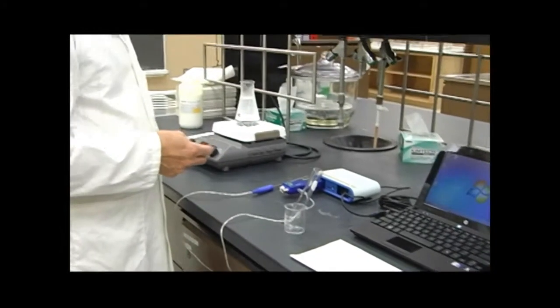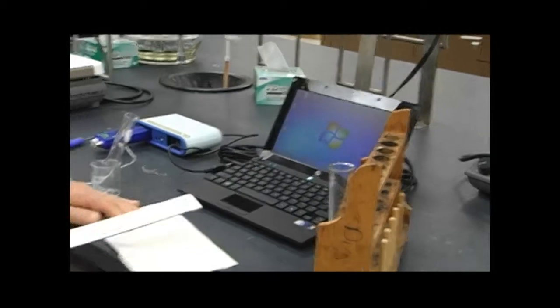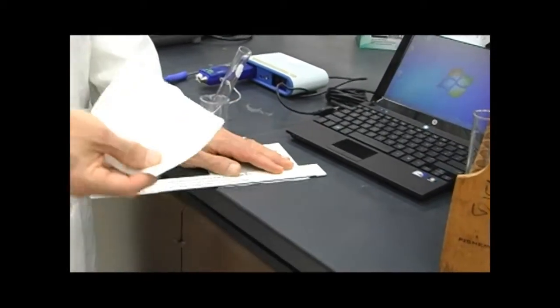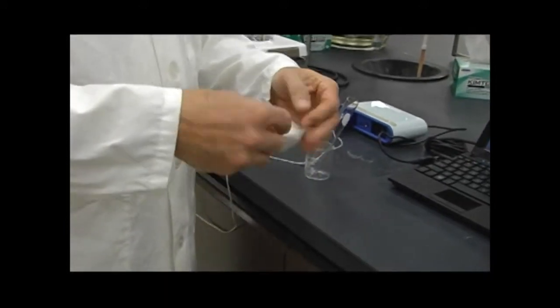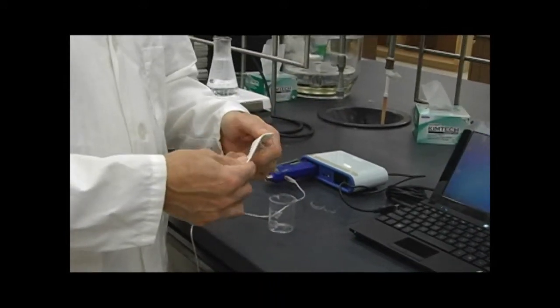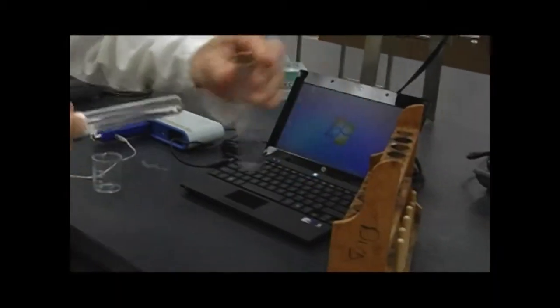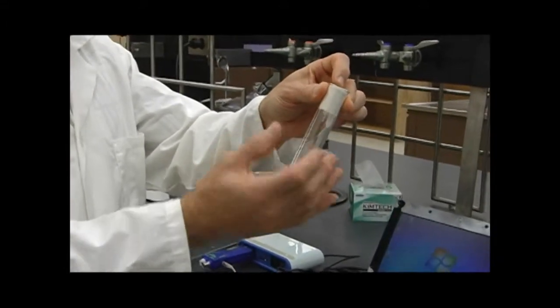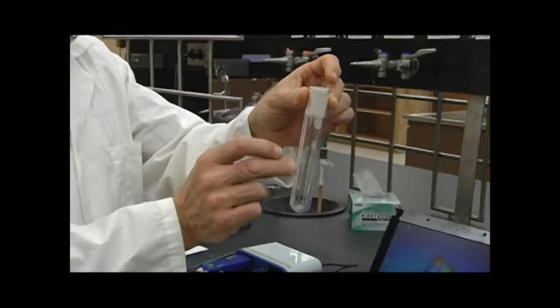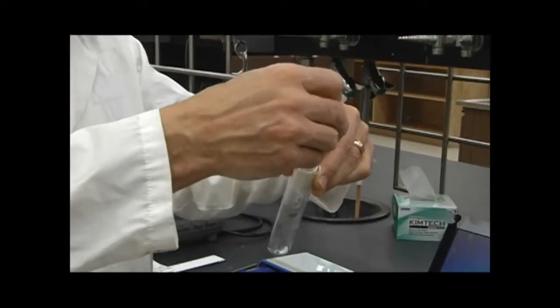Okay, so in order to make the jacket, you'll need a second test tube, and we'll use a paper towel. Just rip the paper towel in half, and then in half again, and then fold that, roll it around the mouth of the small test tube, and then insert it into the larger test tube, so that keeps the inner test tube from touching the outer, and you'll have a little air jacket in between so that the small test tube doesn't cool down as quickly.